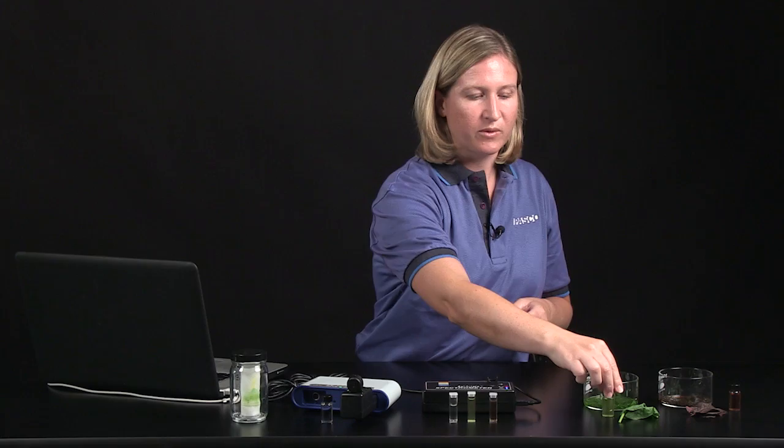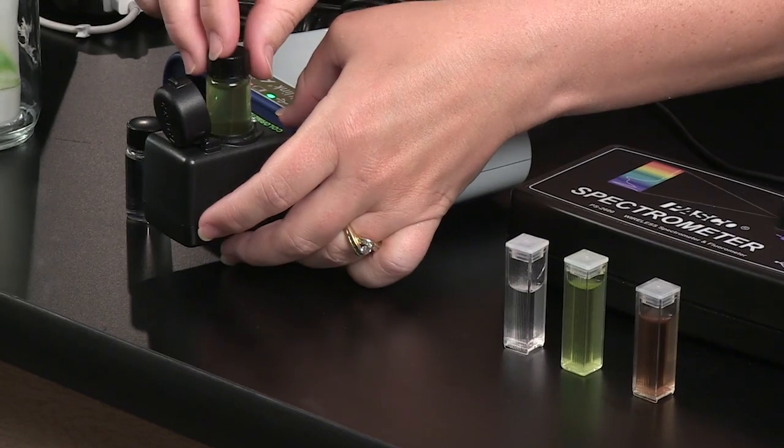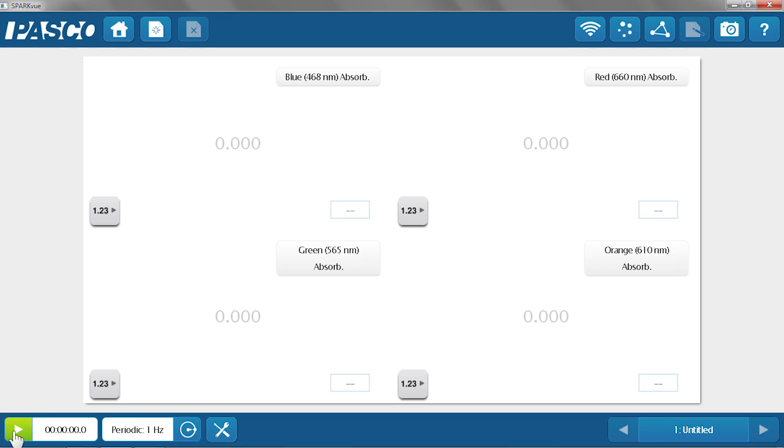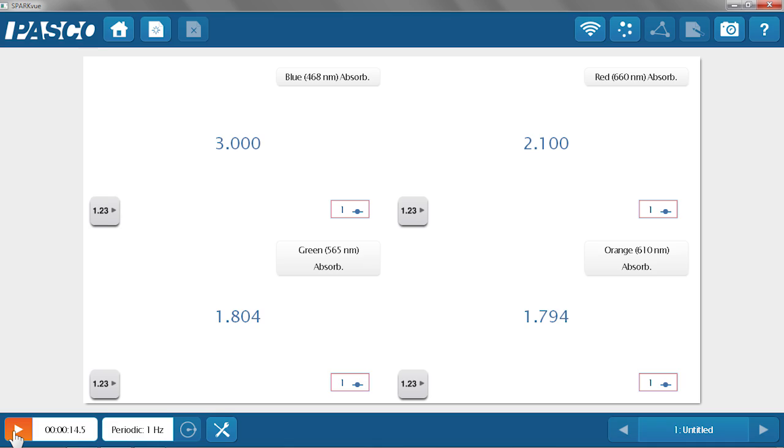Since my colorimeter is calibrated and ready to go, I can take my spinach pigment extract, place it into the colorimeter, snap the lid closed, and hit record. I've created a page in SparkView that shows the four colors of the colorimeter. The lights within the colorimeter shine specific wavelengths of light through the solution — the choices of light colors are blue, red, green, and orange.